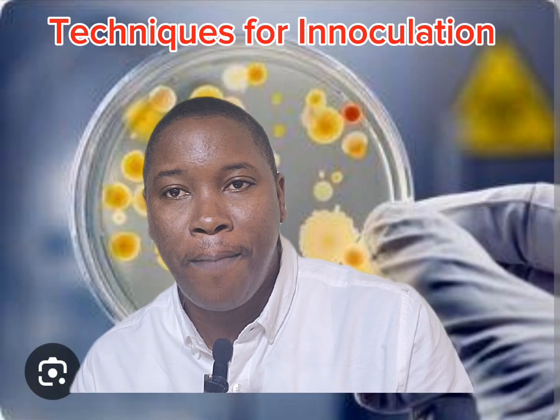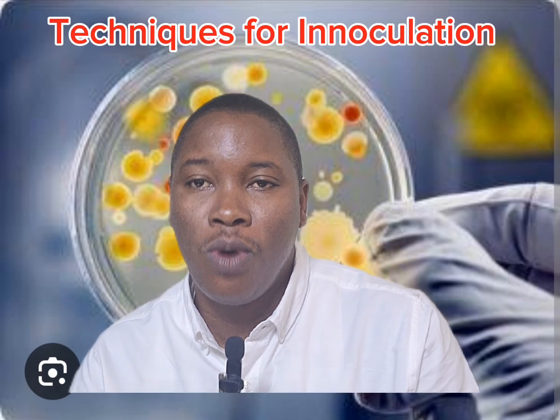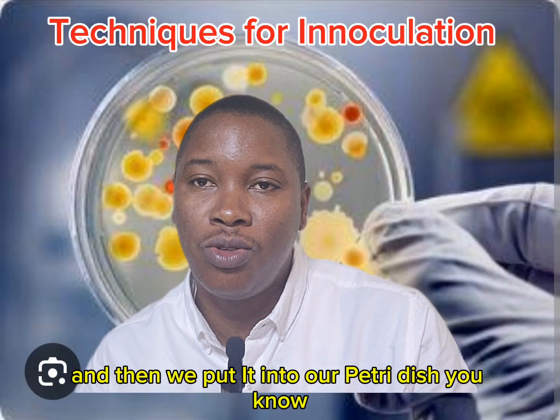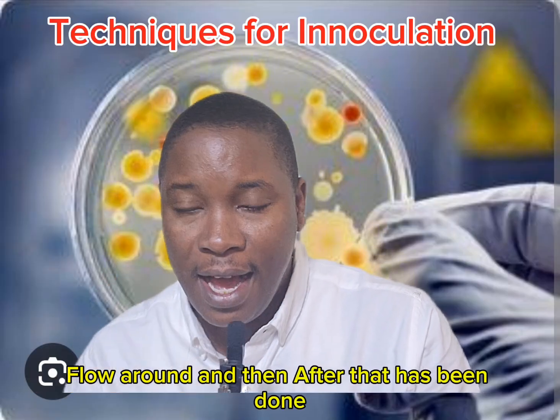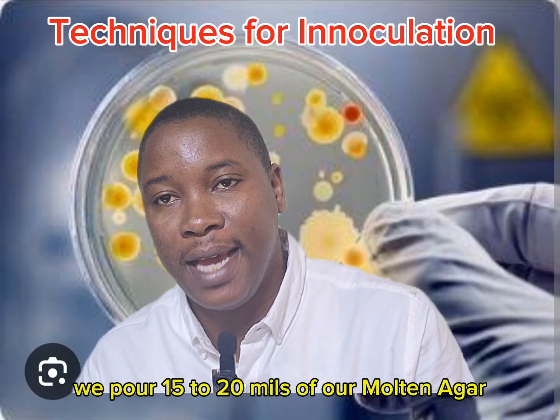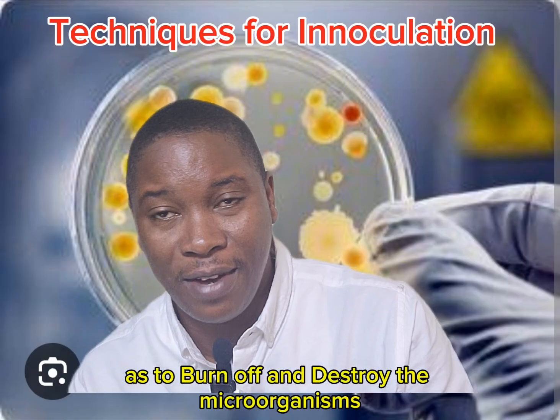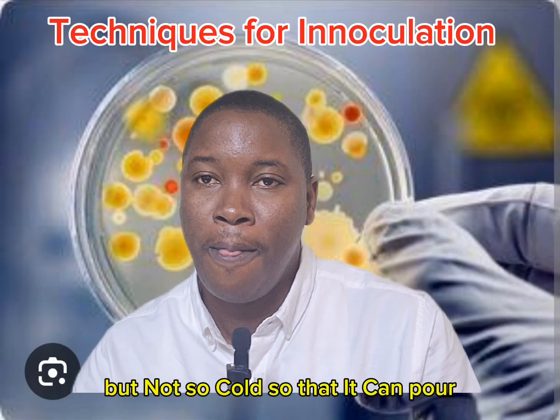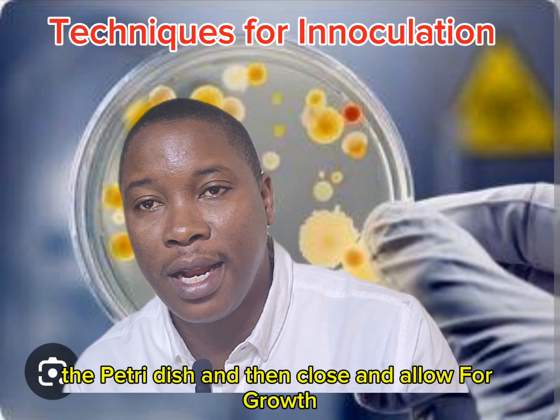The next method is the pour plate method. In the pour plate method, when we've prepared our samples, we take 1 ml of our sample and put it into our petri dish, swirl it around, and allow it to flow around. Then we pour 15 to 20 ml of molten agar. We allow it to cool a little so it's not so hot that it destroys the microorganisms, but not so cold that it can't pour. Then we pour that into the petri dish, close it, and allow for growth.